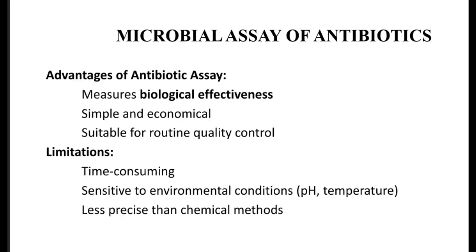Advantage of antibiotic assay. Measures biological effectiveness. Simple and economical. Suitable for routine quality control. Limitation. Time consuming. Sensitive to environmental conditions like pH, temperature. Less precise than chemical method.